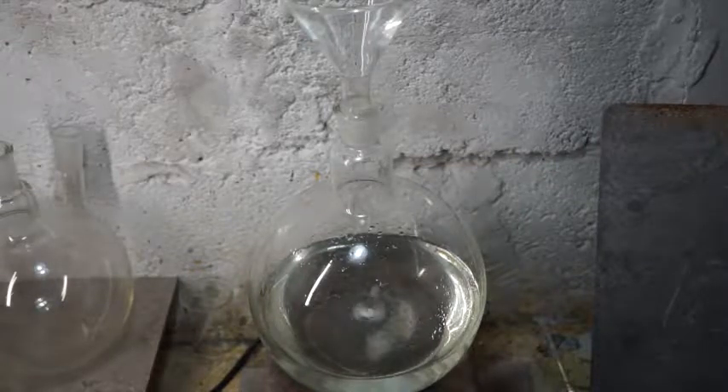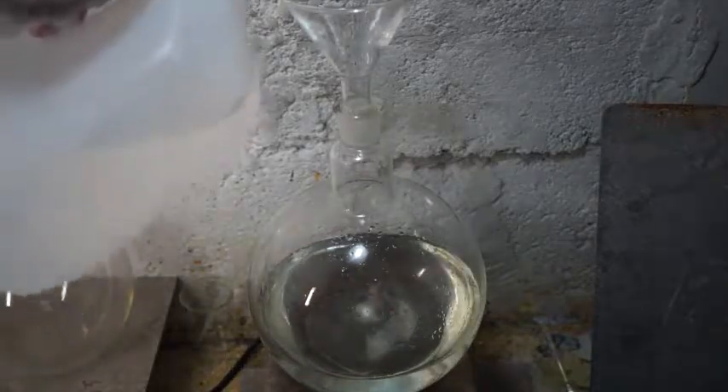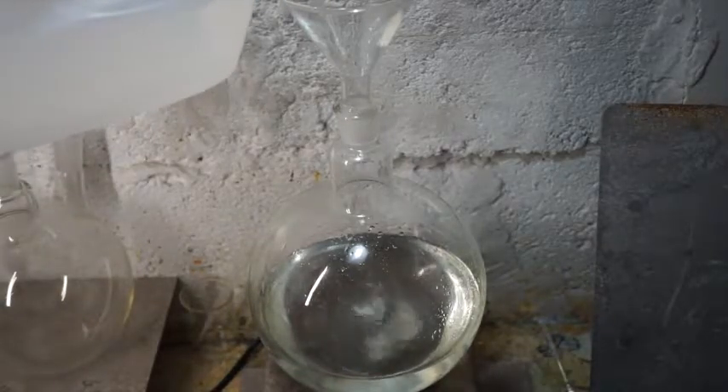Hello everybody. Today I wanted to share with you a phenomenon I noticed while working with some silver nitrate solution.